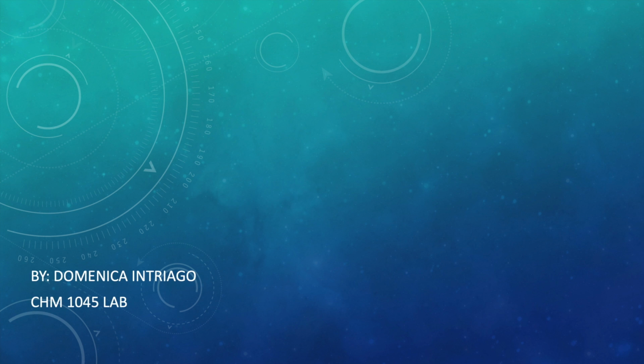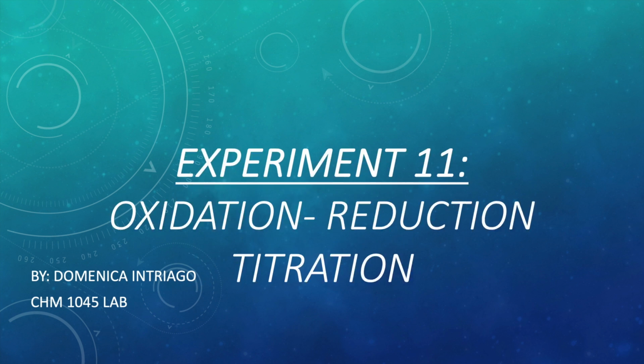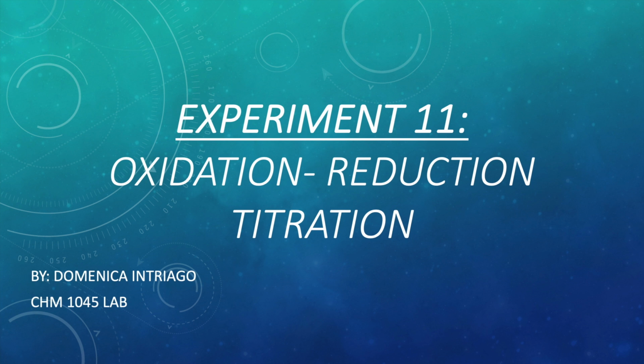I'm part of Dr. G's Chemistry 1 laboratory class at Palm Beach State College, and today I will be talking about experiment 11, which is the oxidation and reduction titration.